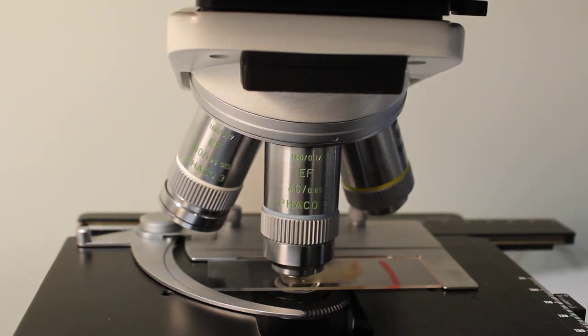So one of the most important components of the microscope of course are the objective lenses which are what allow you to magnify your sample and are what determine what you can see via the resolution that they give your image.